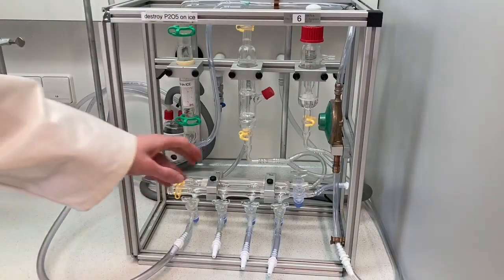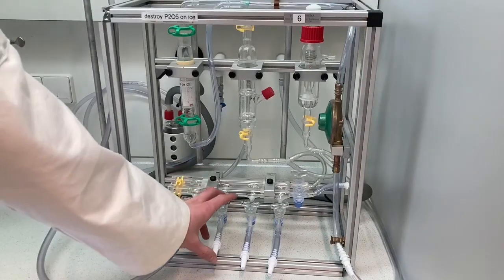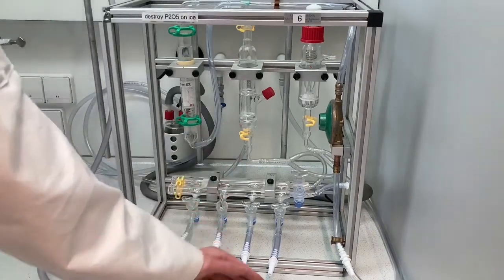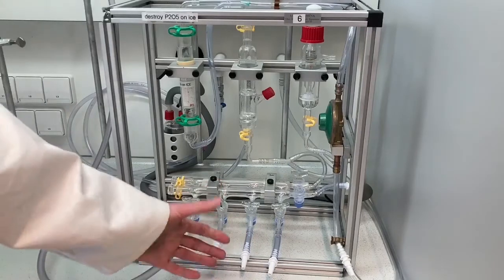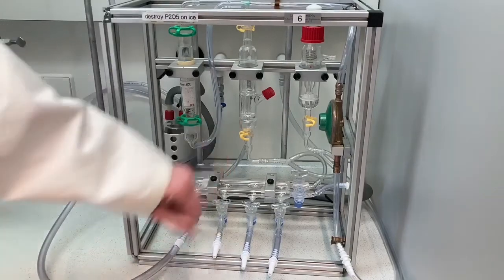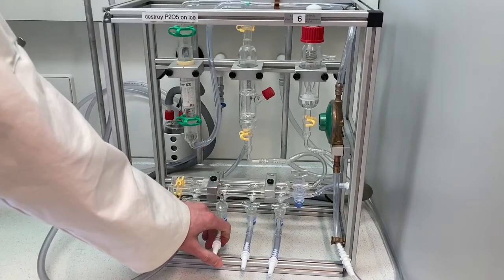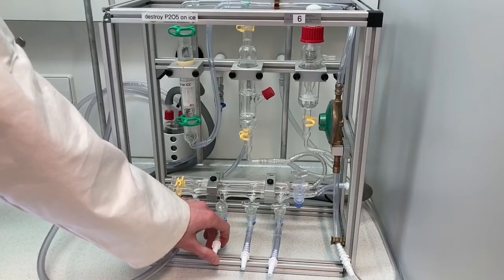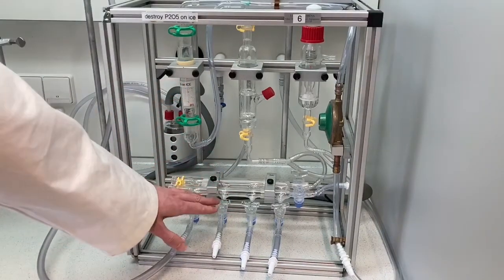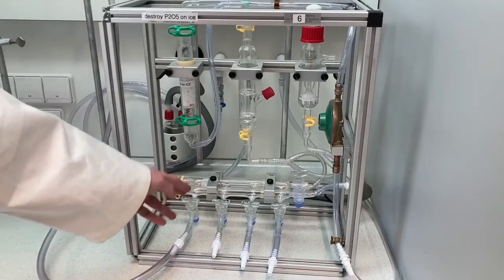To double-check that everything is working and confirm which side of the tap is nitrogen and which is vacuum, we test an open line. Rotating the black tap down, you can see it starts bubbling, and if you feel with the back of your hand you can feel airflow — this is the nitrogen side. Closing the tap stops the bubbling. Rotating to the other direction, you will hear the vacuum, and placing your finger on top it will suck — this is the vacuum side.